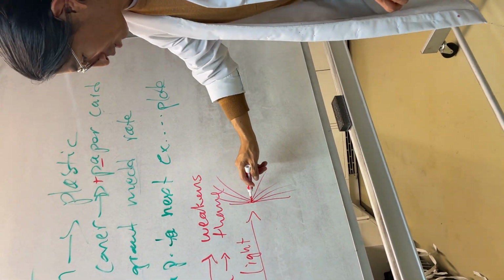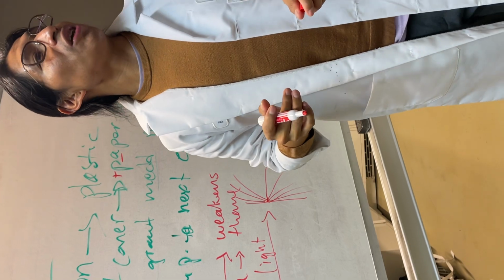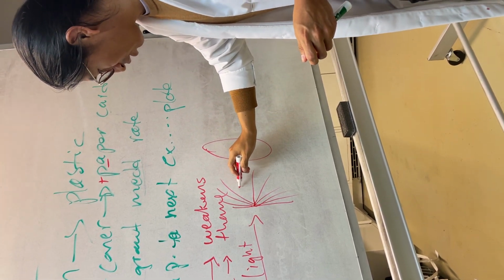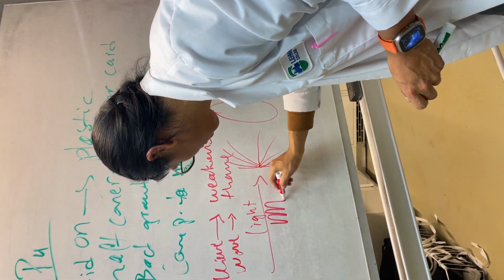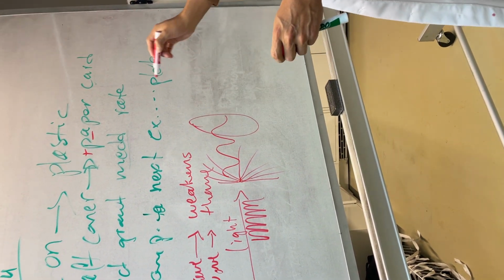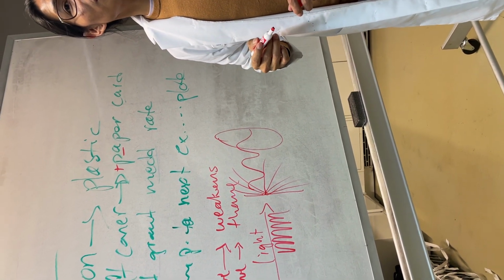The light, when it passes through, doesn't go through directly. It scatters around. That's why it's equal. That's why there is no strength. Once it reaches the bacterial plate right here, it is weak. If I was to draw this, the wavelength is coming in like this, very close to each other. But as it comes in here, it spaces out, which is weaker. This is what in plate 4 you're looking at. Okay. All of them. That's what you're looking at.